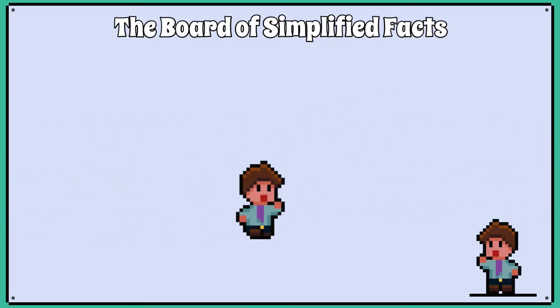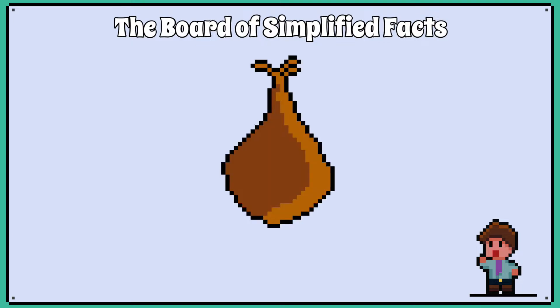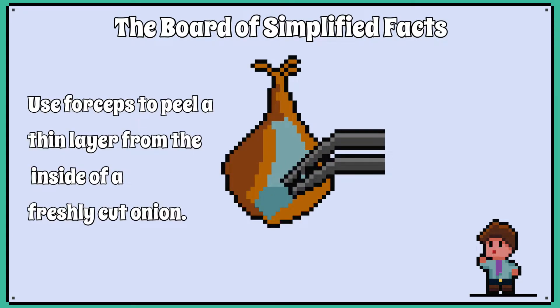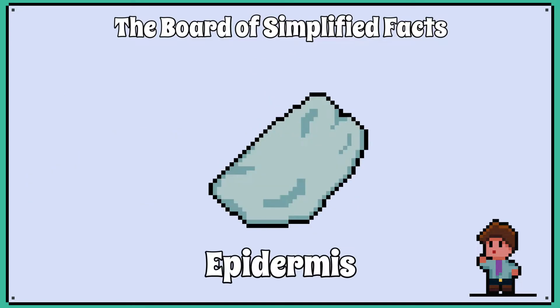For acquiring a plant cell sample we use onions. First we use forceps to peel a thin layer from the inside of a freshly cut onion. A scientific phrase for this thin onion skin layer is called the epidermis.